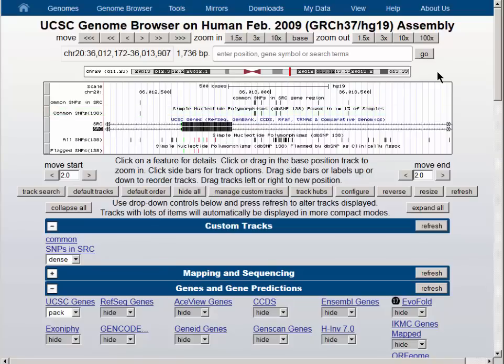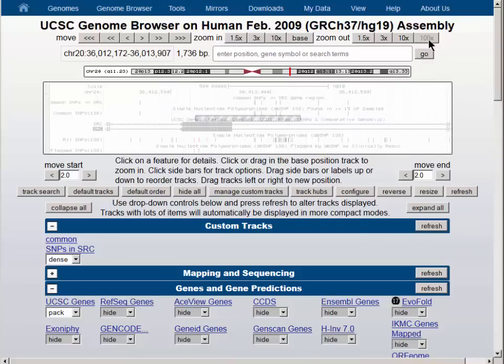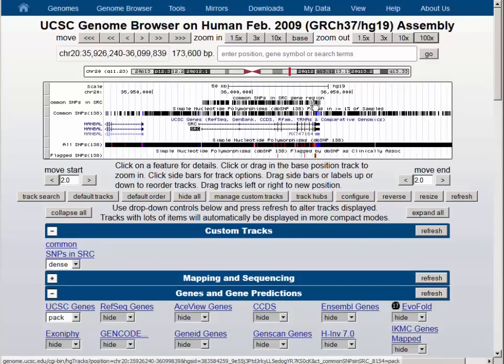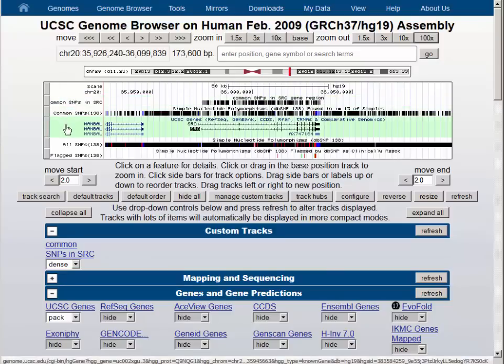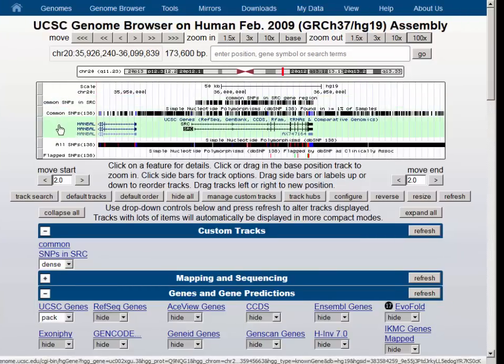To see how we did restricting the range of our query, let's zoom out by a factor of 100, and we can see that all the SNPs in our new track are situated over the SRC gene.